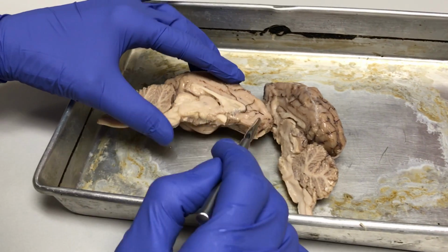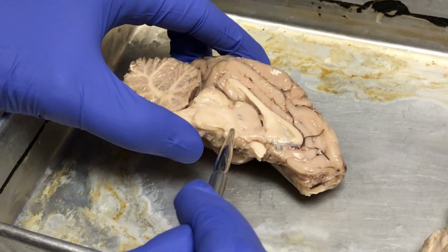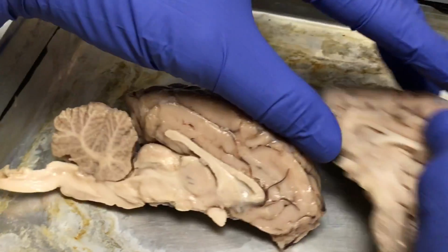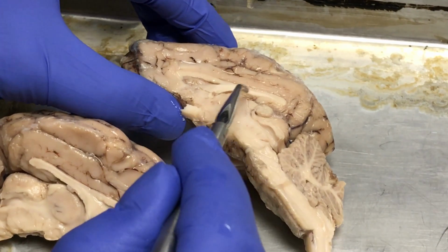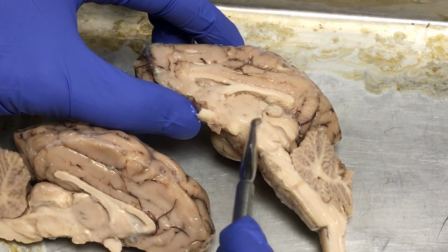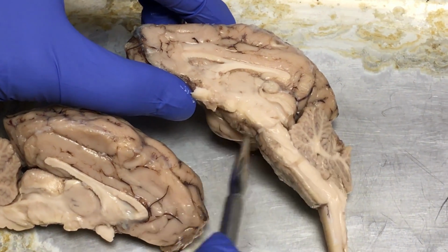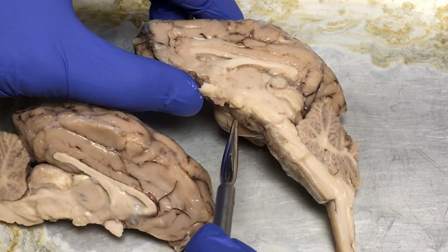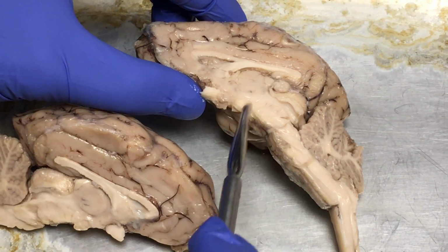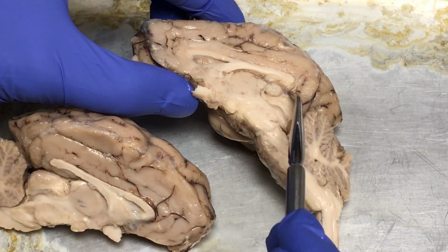Okay, so septum pellucidum. Okay, and this area is the diencephalon, this whole area here, and actually would include the pineal gland, which I think you can only see on this side. So this really round structure here is the thalamus. Okay, and right below it is the hypothalamus. The pituitary gland would be right here, but I won't ask you to identify it on the sheep brain because most of them don't have it connected, but it would be right here. So thalamus, hypothalamus, that's actually the mammillary body. That is the pineal gland.